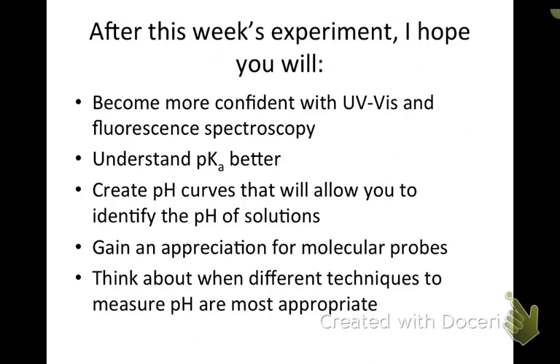After this week's lab, I hope that you will be more confident using UV-Vis and fluorescence spectroscopy, which are very useful analytical techniques. I hope you'll be more comfortable with pKa and pH. The pH curves that you create will be used later in the semester during the lab exam to determine the pH of unknown solutions. So this will come in handy for you. I hope that you will gain an appreciation of molecular probes, and that as you write your lab reports, you will think about when you would use molecular pH probes rather than pH meters, and when you might choose one pH probe over another.